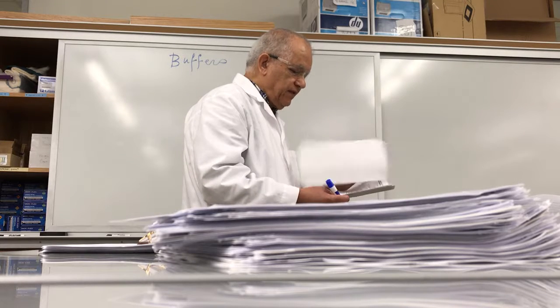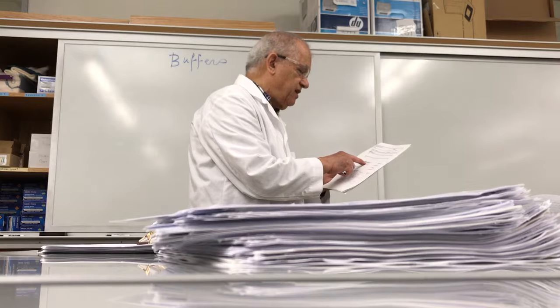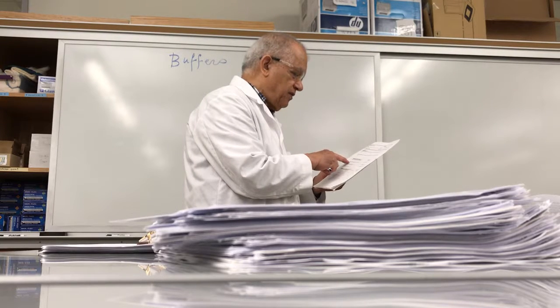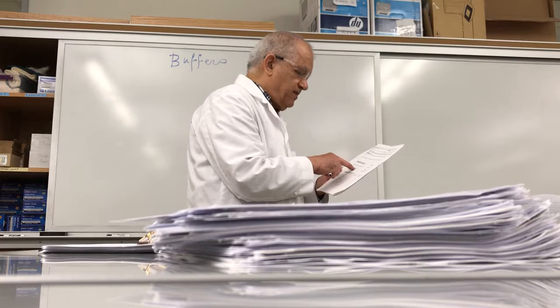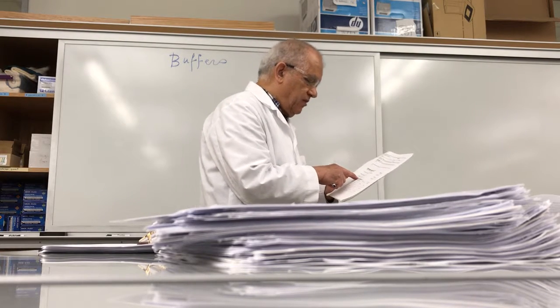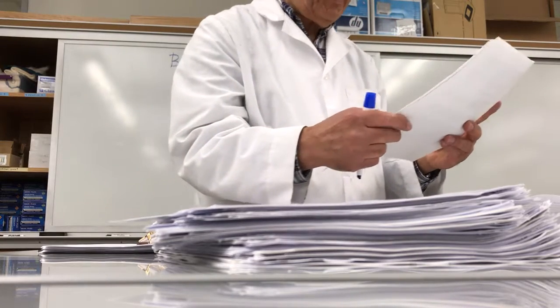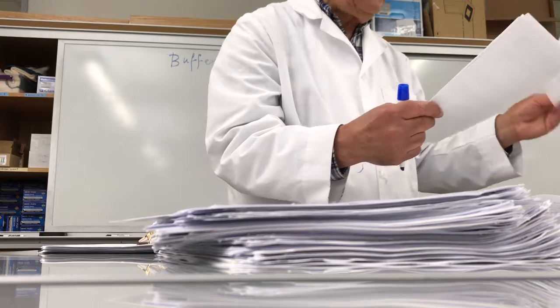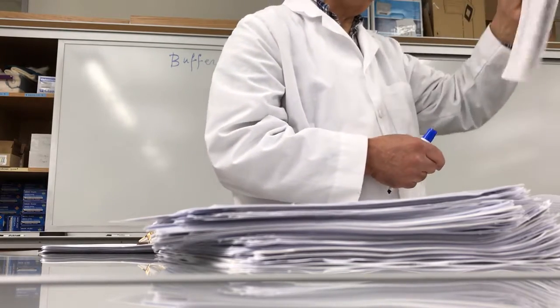You're already given the data: mass of sodium acetate in the acetate buffer, volume of acetic acid in the acetate buffer, mass of ammonium chloride, volume of ammonium hydroxide, and then the experimental results. Now you go back and answer those questions here.